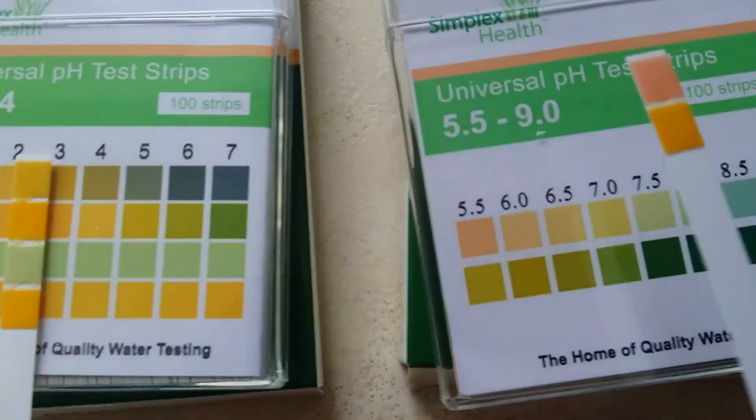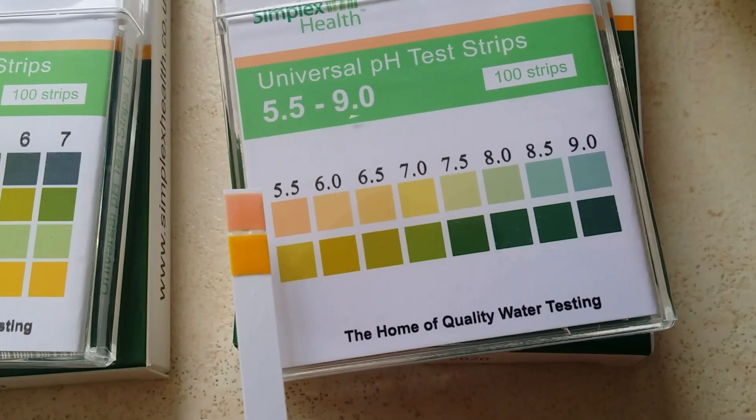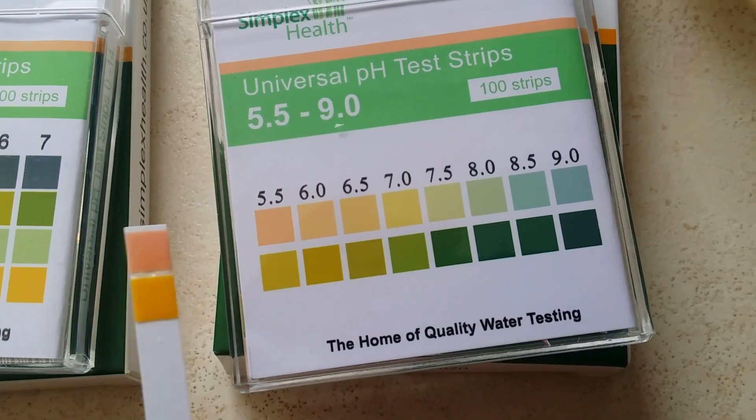So just quickly dip them in there, take it out, and as you can see the strip colors change straight away. Now the top one's gone real pink, the bottom one's gone real orange, so that would actually fall in the range down here — the 2 and 3.